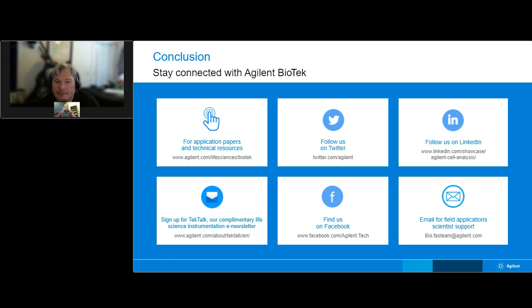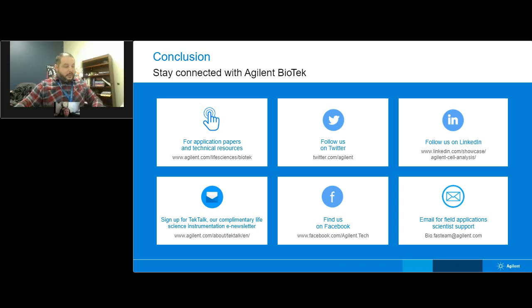Oh, yes. That's a great question. Yeah, so you have an option. Now with the deep sectioning disk, you have an option to choose between those two setups. And a lot of it comes down to the fundamentals of confocality, is that the diameter of that pinhole really dictates how much out of focus light you're able to remove. Now, the tricky thing about spinning disk setups is that you're stuck with one diameter pinhole, either the 60 micron or the 40 micron pinhole.